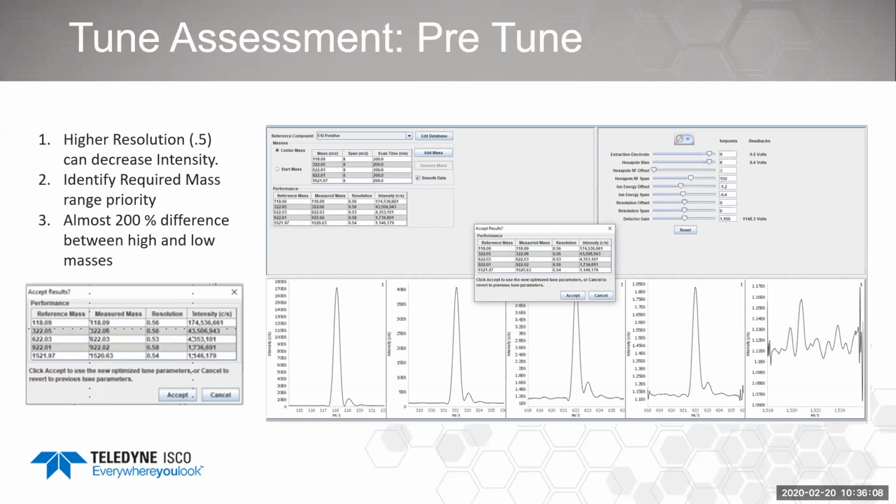But yeah, those are typically our two flow rates. It's 0.5 mL a minute and 0.7-ish. I think it's 0.75 or 0.7. I don't know the NextGen off the top of my head, but it's in that ballpark. Are there any other questions?